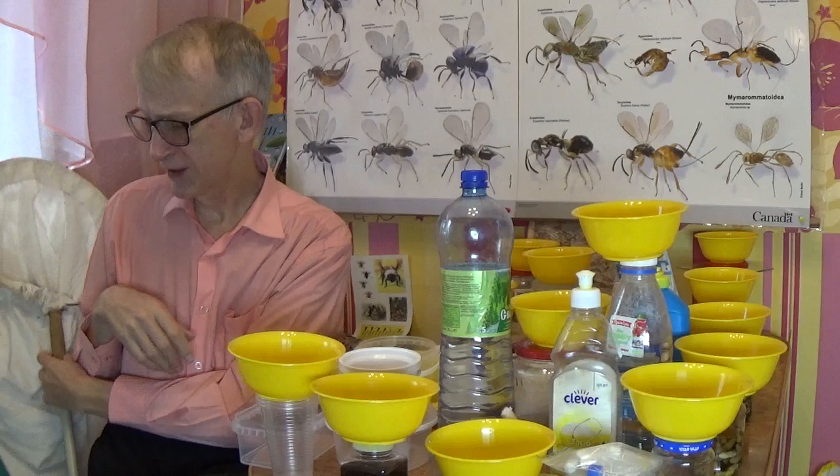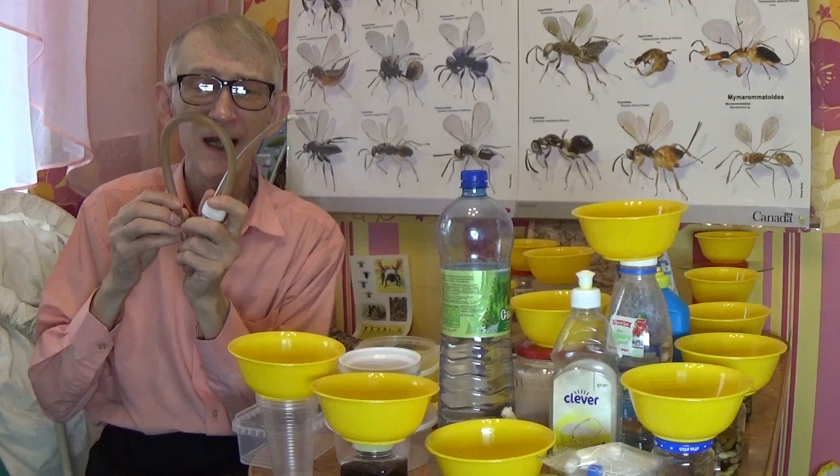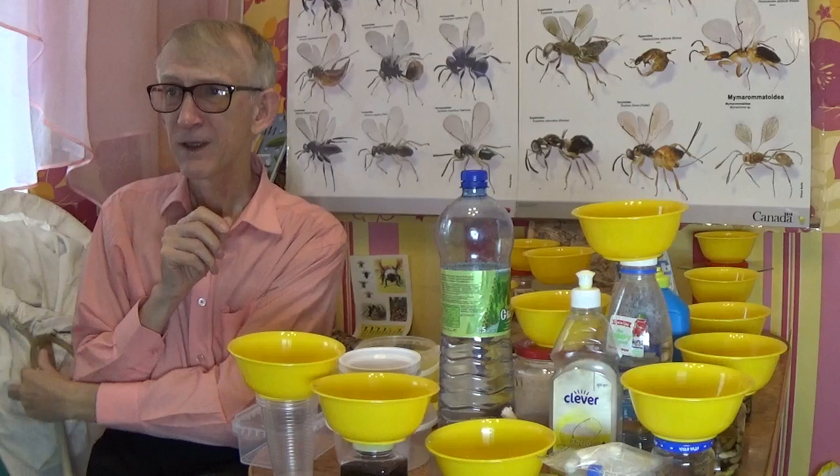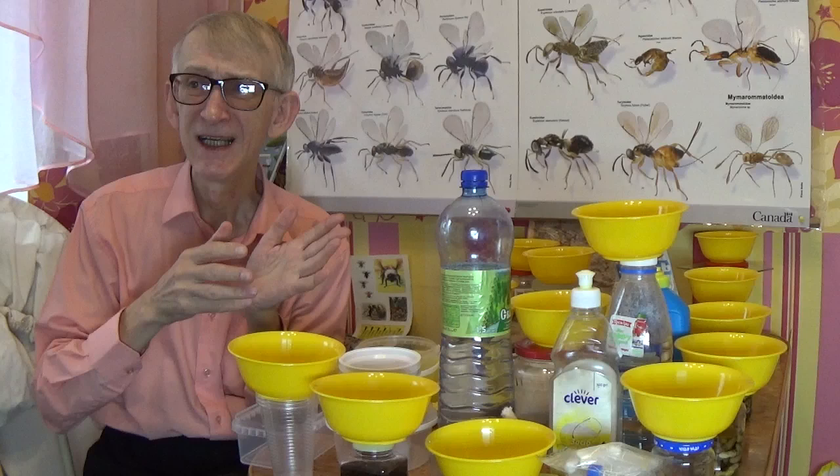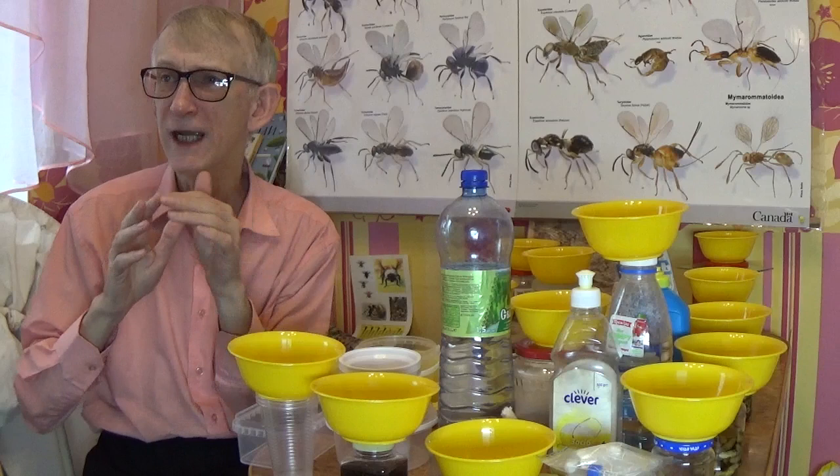It's difficult to collect these tiny insects using conventional methods like a sweeping net or butterfly net, because they are very small. You need to use an aspirator and also need very precise attention and sharp eyes. Time is limited, but with this trap you can extend your collecting time up to days.